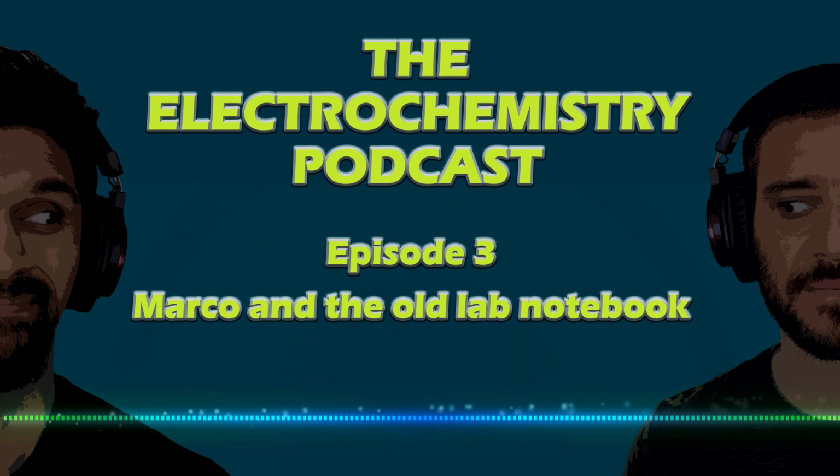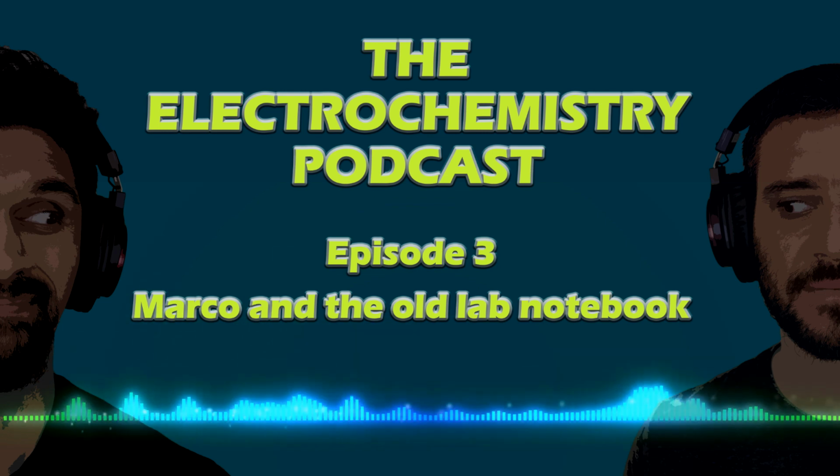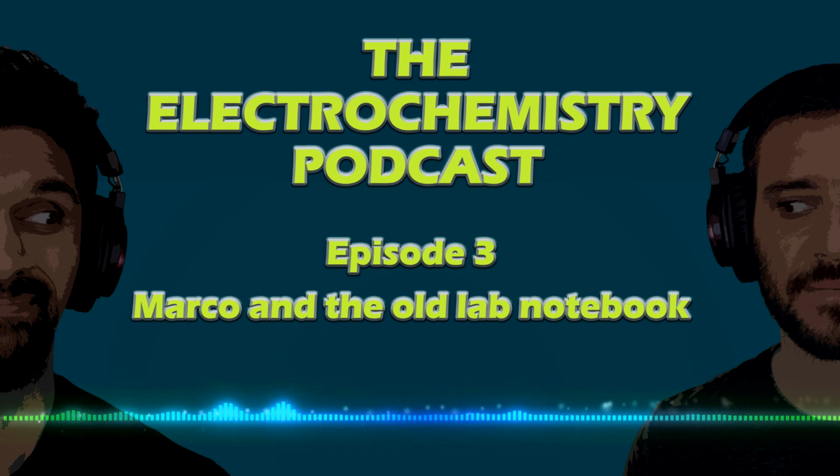Speaking of family, water's family is getting upset when you try to zap it with -2 volts, which is part of Marco's problem. He's applying way too high of a potential to his working electrode in an aqueous system.